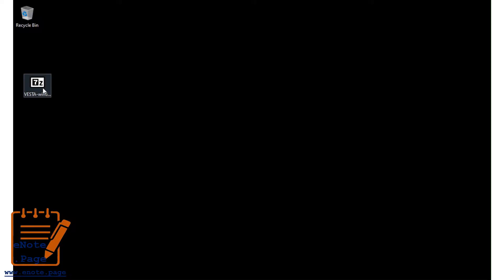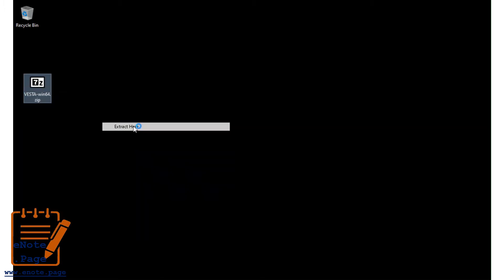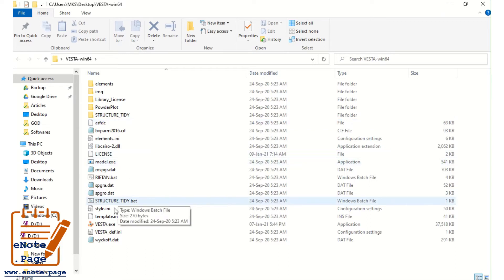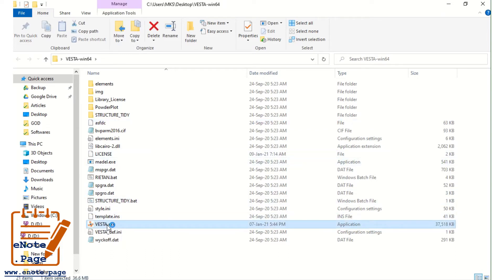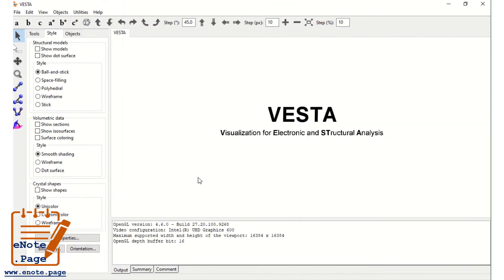The program is downloaded. Now unzip this. Open VESTA.exe. This is the main window. We are having different types of tabs here. Now let us start with a simple example.